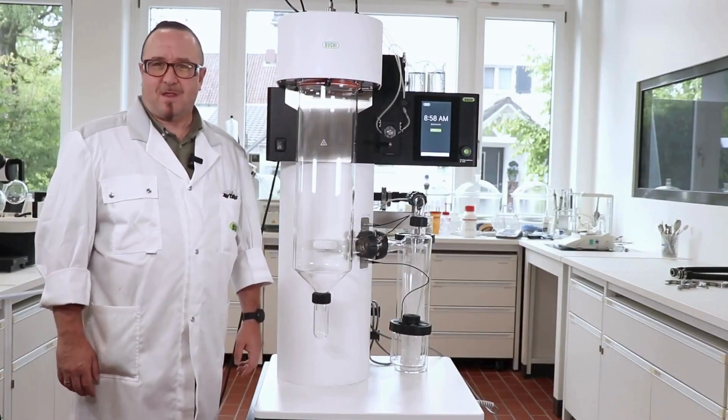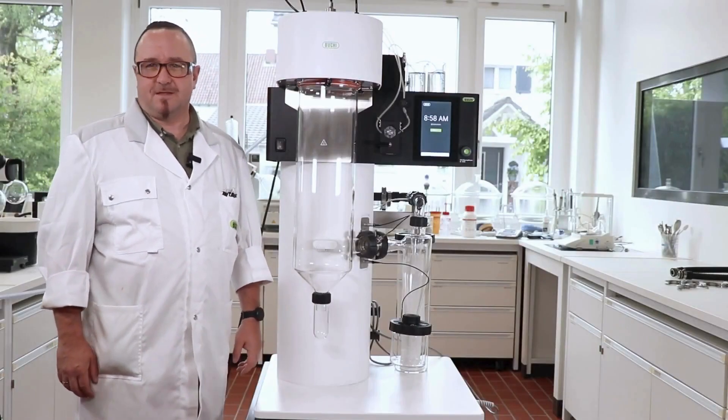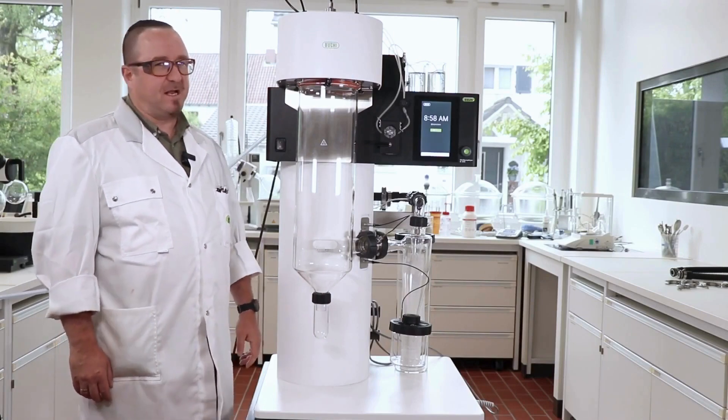Hello, my name is Willi Hüsler. I'm working for Büchi Labortechnik in Switzerland. I'm a product specialist for spray drying.